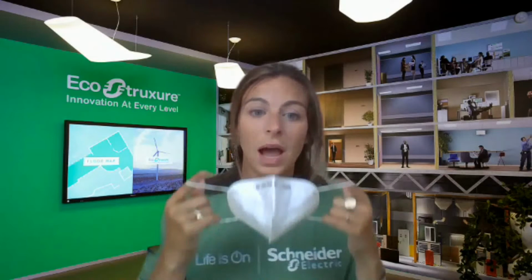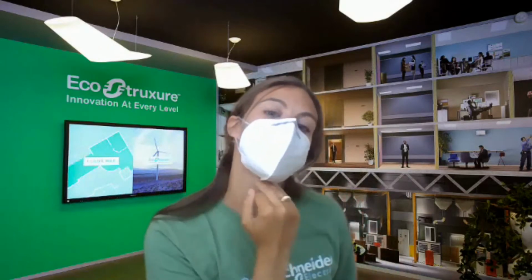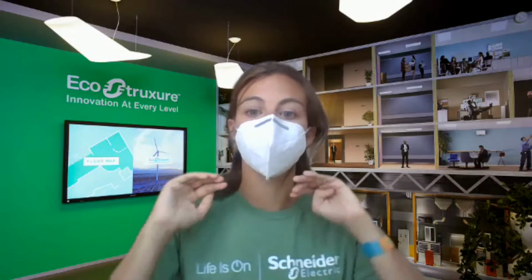I will be picking up my KN95 mask by the ear loops, at no point touching the surface of the mask. Before I put it on, I want to make sure that I have the metal bar up and the point facing out. I'm going to cover my nose, my mouth, and my jaw and loop around my ears as so. Let's make sure that the mask is sealed under my jawline and there's virtually no room for respiratory particulates to escape from the bottom of my mask.